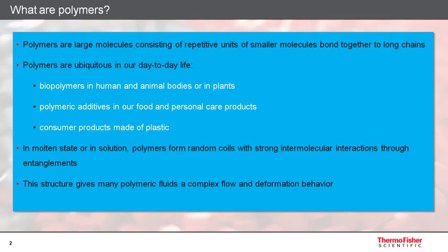As a melt, or when dissolved in a solvent, polymers form random coils and build very strong intermolecular interactions through entanglements. Due to the complex molecular structure, many polymeric fluids also show a complex flow and deformation behavior.